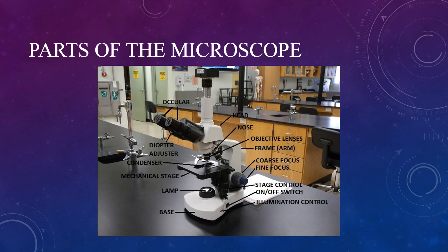The frame, or arm, holds the mechanical stage and the coarse and fine focus. The base is the bottom section of the microscope and houses the electronics, the on-off switch, the illumination control, and the lamp.